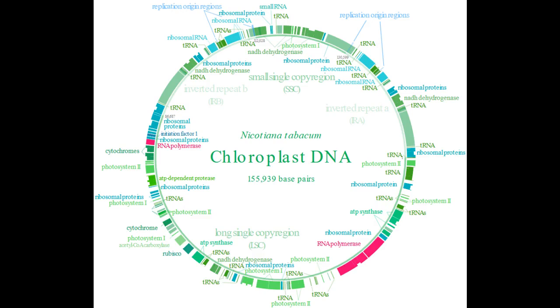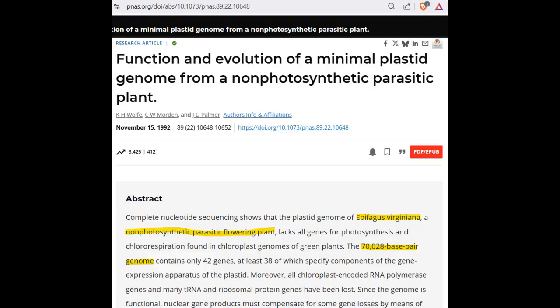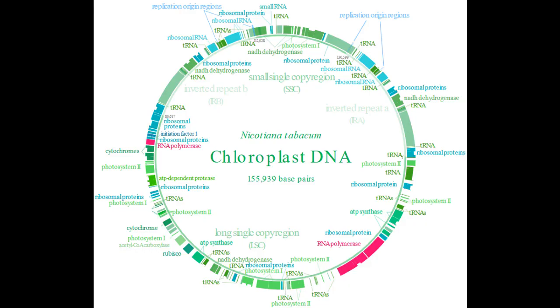However, there are some exceptions. Some plant plastomes extend up to 200 to 240,000 nucleotides. I don't show them here. While others, particularly these parasitic plants, have drastically reduced plastomes as small as 30 to 40,000 nucleotides. These parasitic plants rely on other plants for survival, so they lose part of their plastomes over time. Otherwise, plastomes are generally highly conserved, which makes them particularly interesting for comparative analysis.